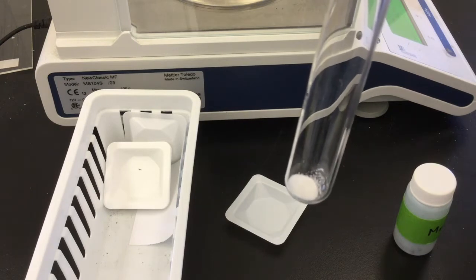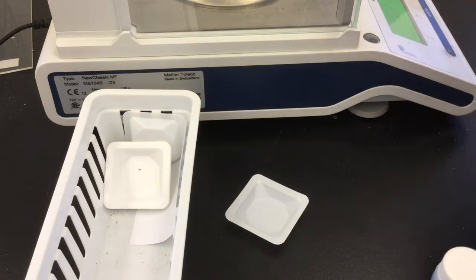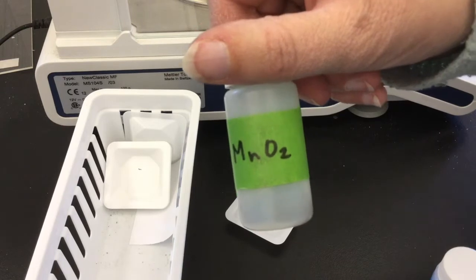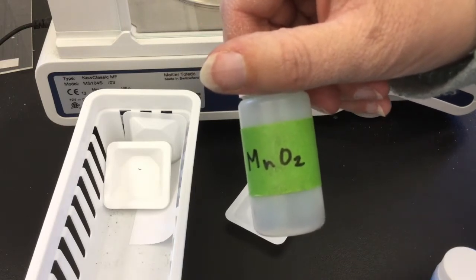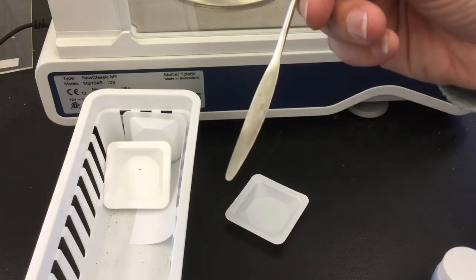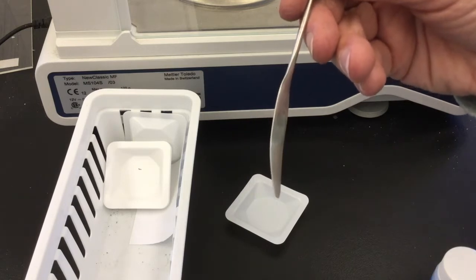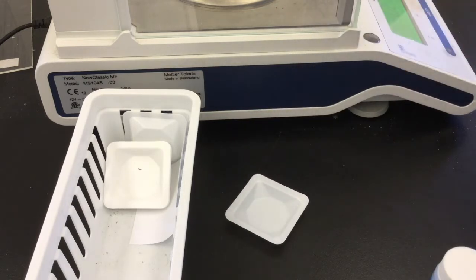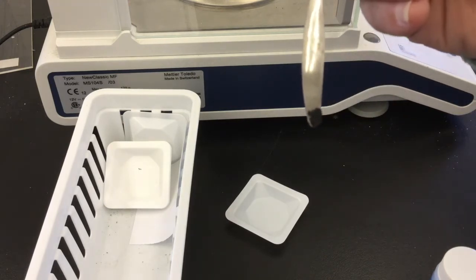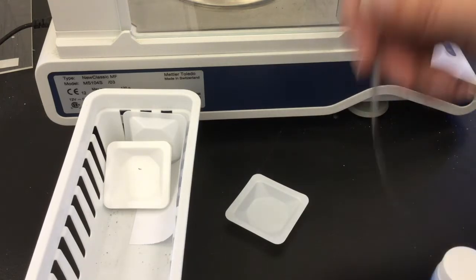Finally, you are going to add a very small amount of manganese oxide. The manganese oxide is going to serve as a catalyst. Catalysts are not used up in the reaction, so we only need a very small amount. Use the smaller of the spatulas. Don't mix up the spatulas between the 2 chemicals or you could contaminate them. You're just going to get a tiny bit on the tip of the spatula. You don't need very much. And tap that into your test tube.